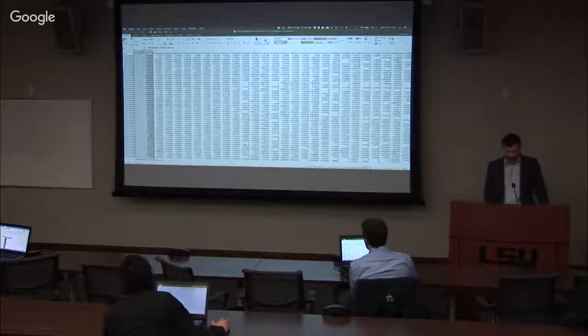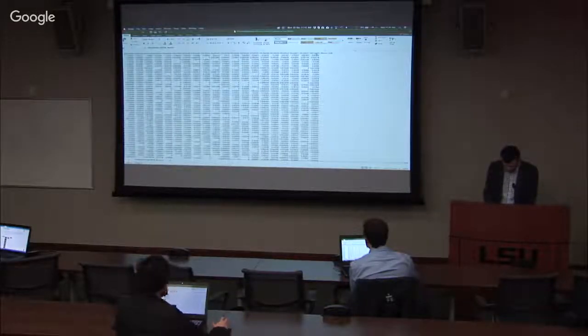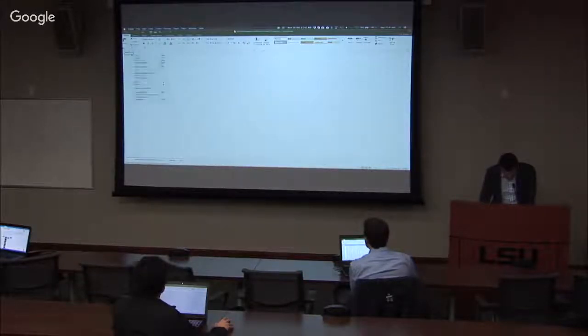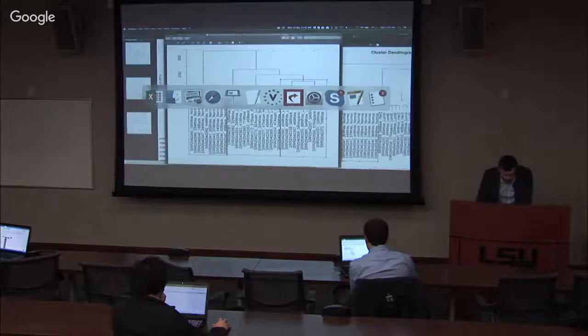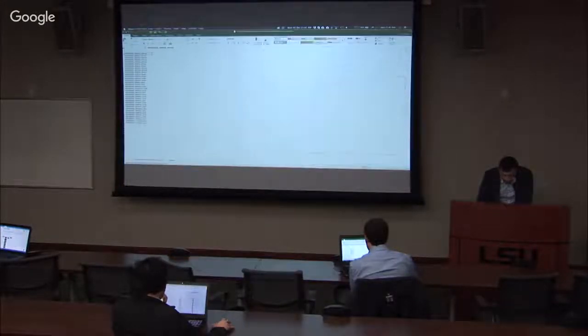So what I will do is I will take the names of the columns, which are my samples, and I can just paste them here and transpose them so that I get them as names of rows. And as you can see, my labeling here at the end is very simple, right? I have normal, basal, whatever, but I want to now take a look at my dendrogram and label it according to what I separated there.